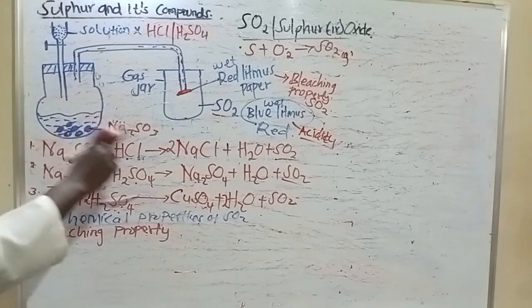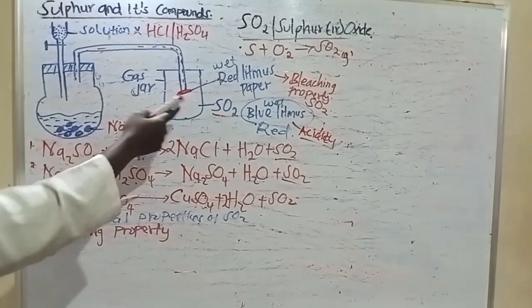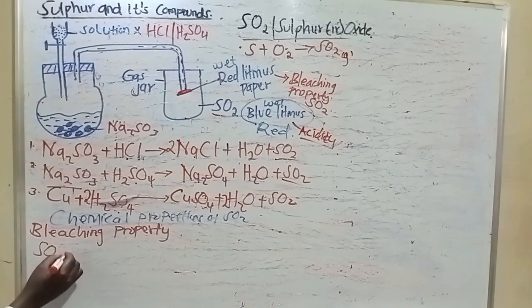The reaction that is going to occur here, we are going to have our sulfur 4 oxide. It is wet, yeah?